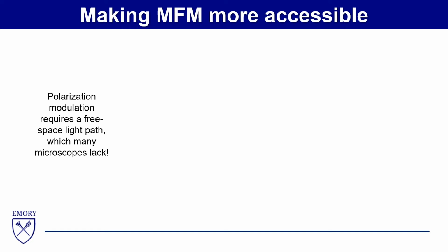Once we developed the technique, we started thinking of ways to make it more accessible to biological researchers. We found the limitation of our approach is that it's impossible to modify many commercially available microscopes to implement MFM. Our microscope scheme is pretty simple, and the addition of a rotational actuator should be pretty trivial to people who have their microscopes built out on an optical bench.